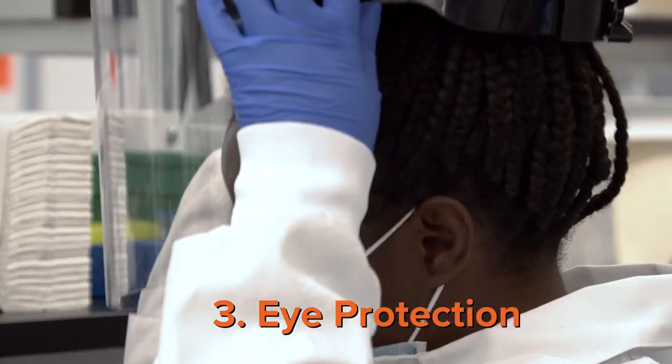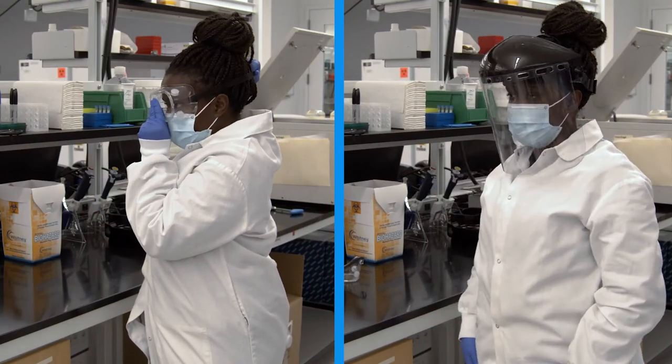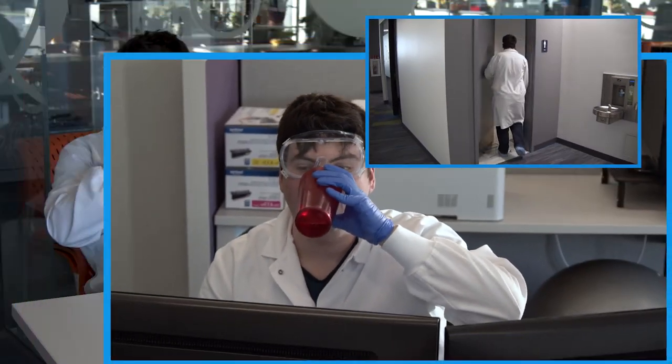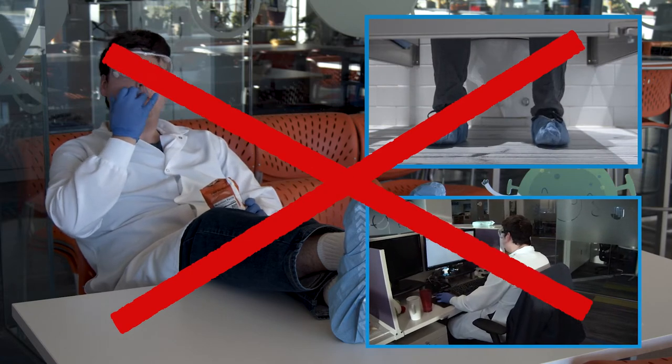Eye protection such as a face shield or goggles can be used as necessary. For BSL-2 work, make sure that you are wearing your goggles or a face shield at all times while in the laboratory. Please make sure that you are only wearing these items inside of the lab. Your lab coat should not be worn in common areas such as the bathroom, offices, or the lunchroom. Make sure you keep these items in the laboratory.